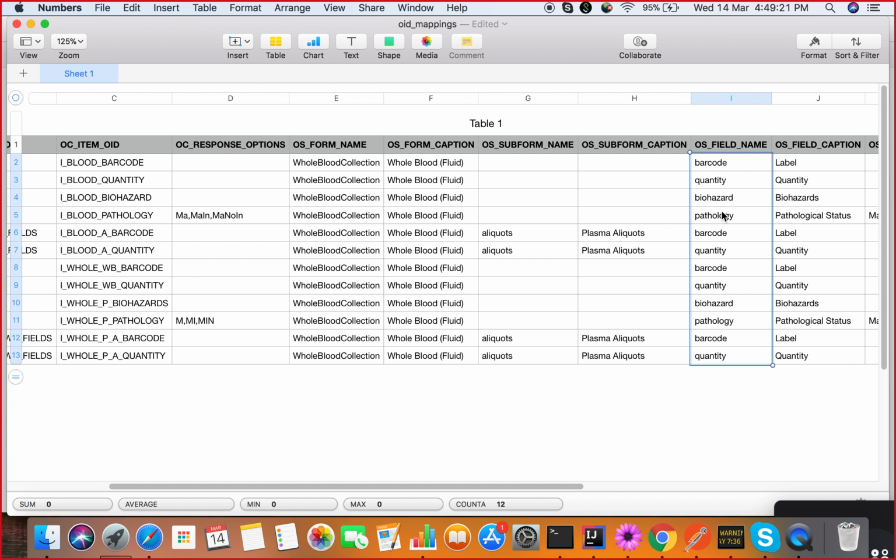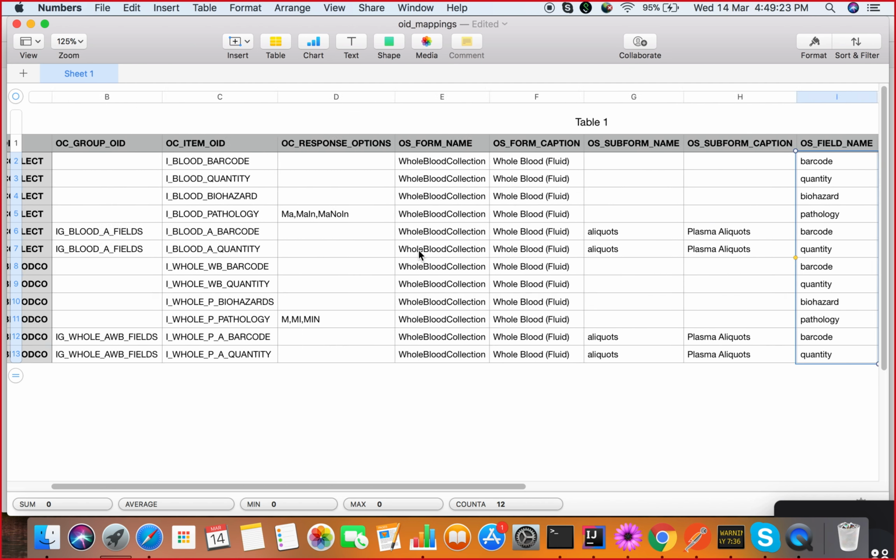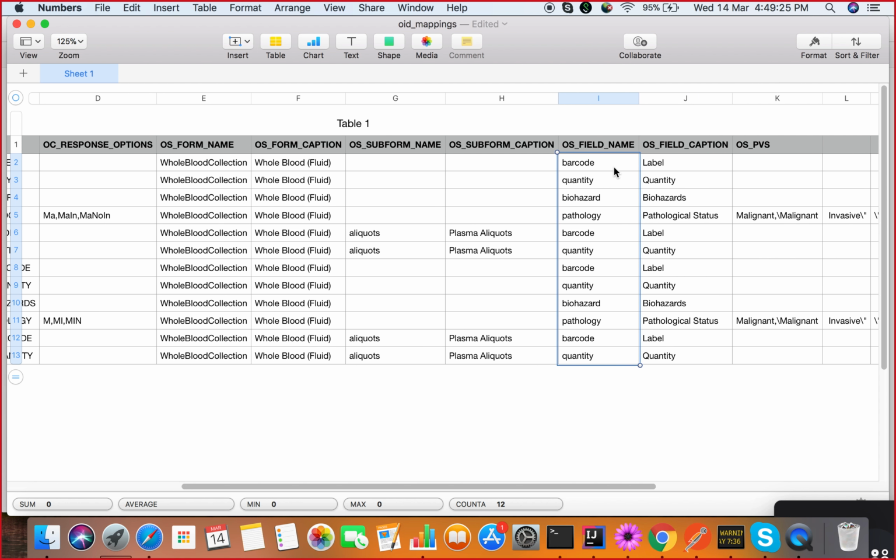No, it is your CRFs, so you will design what the name should be. So we will not provide you anything. It is you who will design all these field names, what they should be, and what their values should be. So we will not be providing anything.